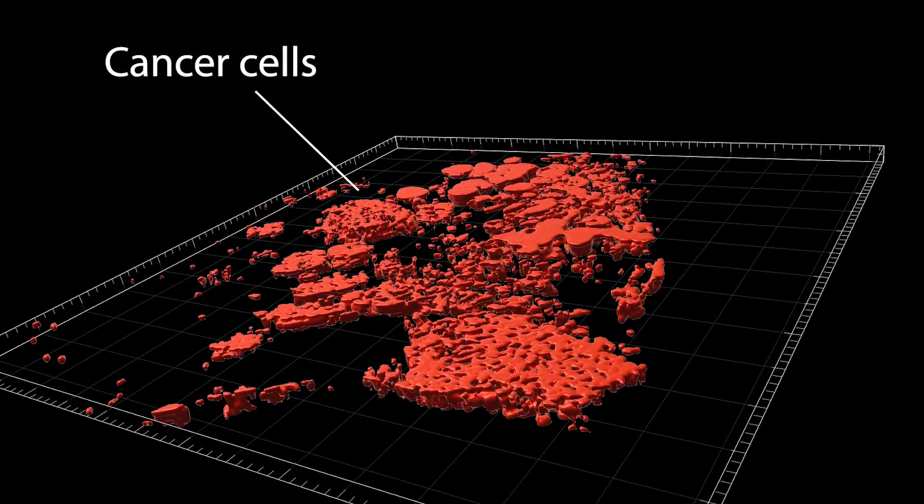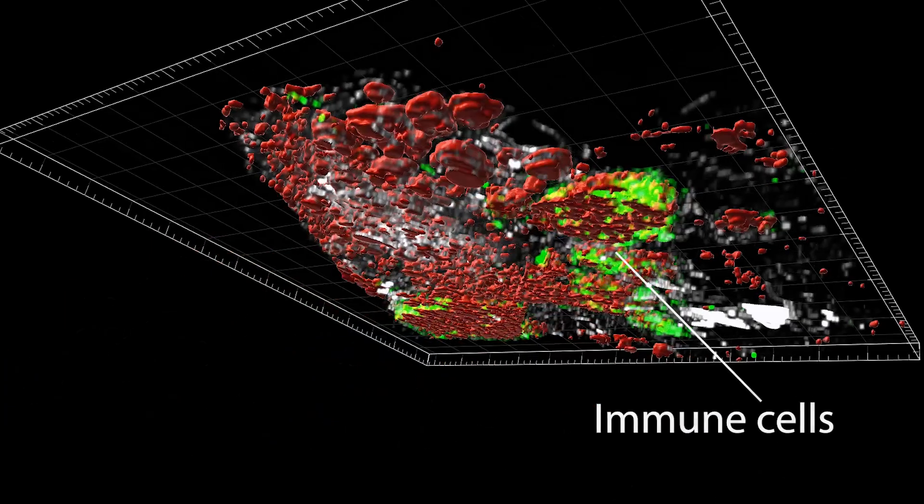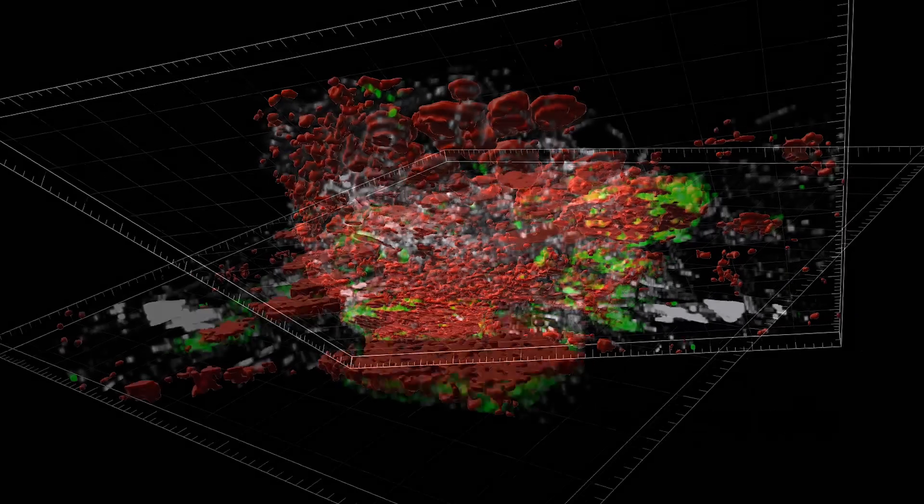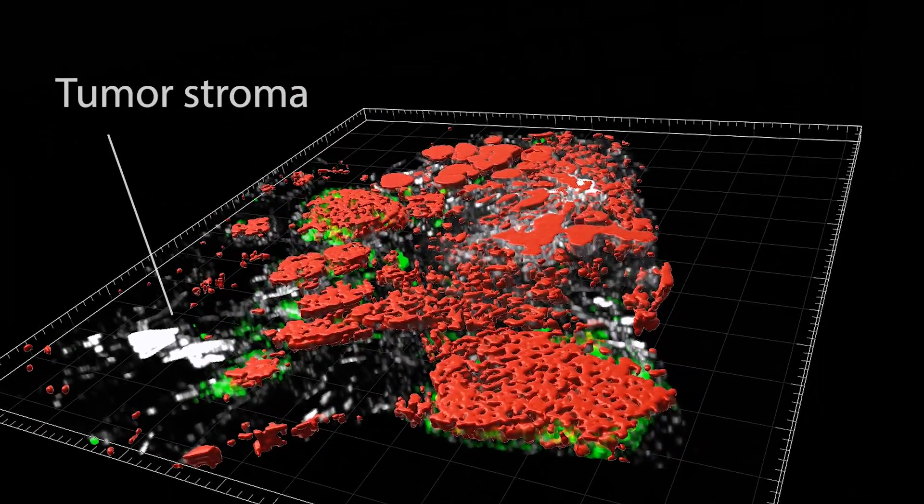In this breast tumor, cancer cells are in red, immune cells green, and support cells called the tumor stroma are white.